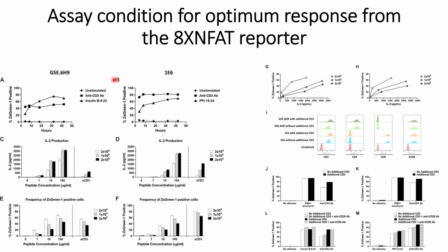In this video we will discuss the assay conditions for the optimum response from the 8XNFAT reporter. So far we have optimized this 8XNFAT reporter in terms of the promoters that can be used before the reporter genes and the reporter proteins that give us the optimum signals. Here the researchers have checked what the optimum conditions for the assay are.